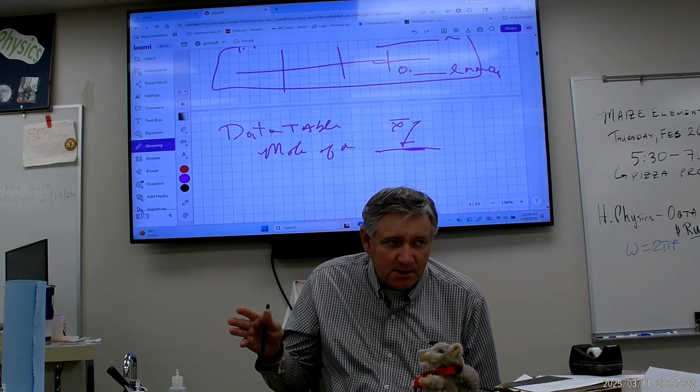Okay. And then the whole thing that you're searching for is underneath that data table where it says the molarity of the oxalic acid. That's going to be the average of those 2 trials. Okay. Now, let's talk about what has to happen. So, if you look on part 2 in the instructions, this is kind of important that you get this right.